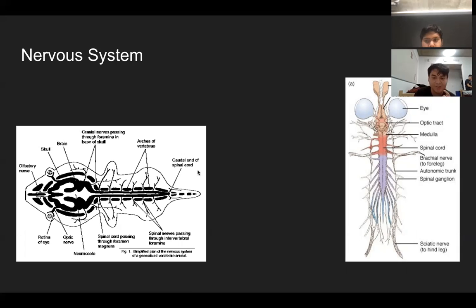The cranial nerves are around the brain, while the spinal nerves are obviously around the spinal cord. And the reflexive reactions are an involuntary, unplanned sequence or action, a nearly instantaneous movement in response to a stimulus. That would obviously be triggered by the nerves in both the frog and the rat.